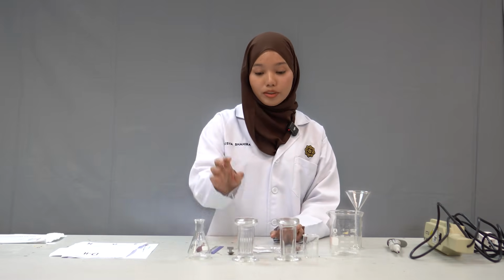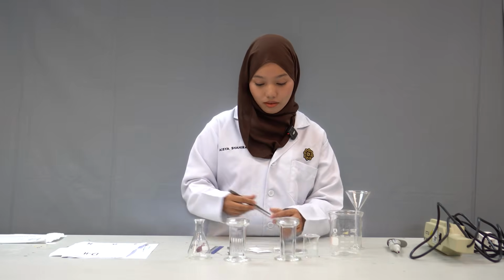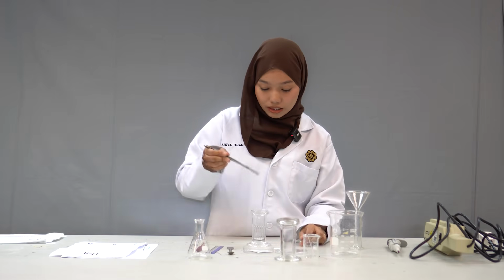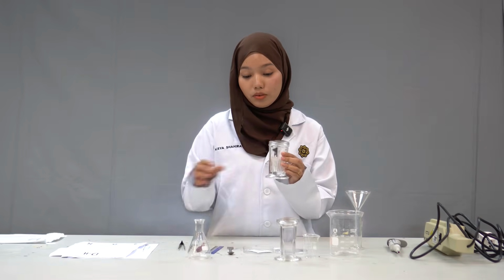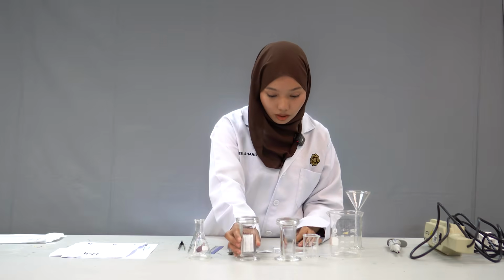Next, we put them aside and move back to our TLC plate. Using forceps, we put our TLC plate into the developing chamber, make sure it's vertical, close the lid, and let the solvent rise to within 1 centimeter from the top of the plate.